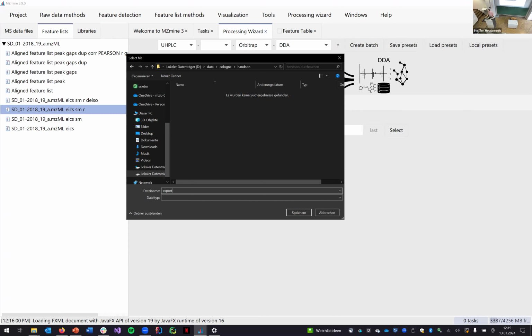Meanwhile, they are working, Steffen. So you just did it for one feature. Yeah. Of course, if I'm doing targeted analysis, I go to my feature and play with this feature as you just saw. Yeah. What would you suggest for non-targeted then?